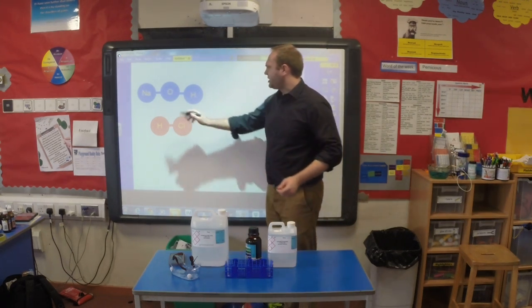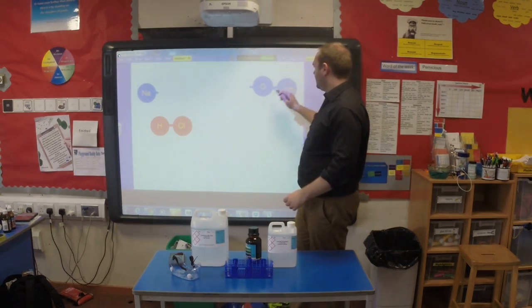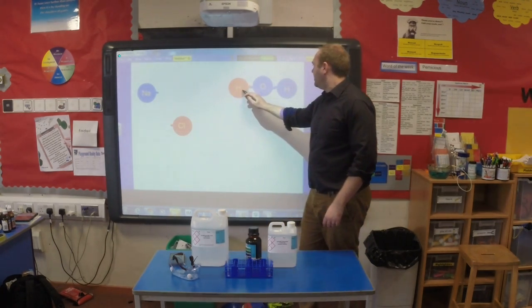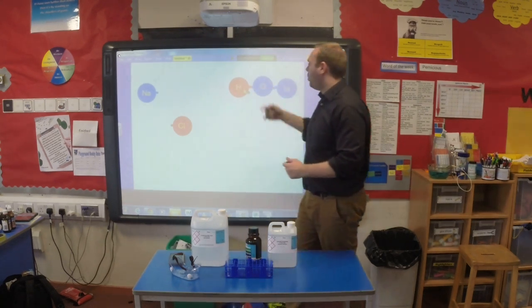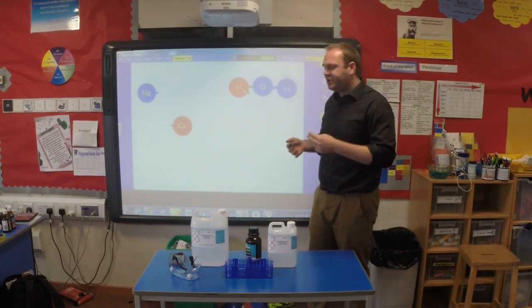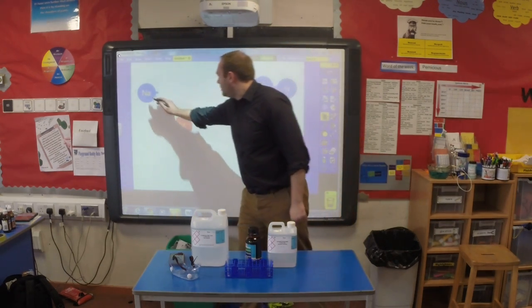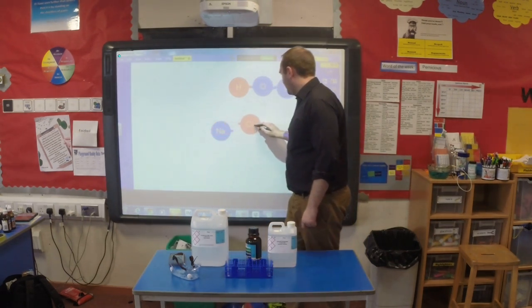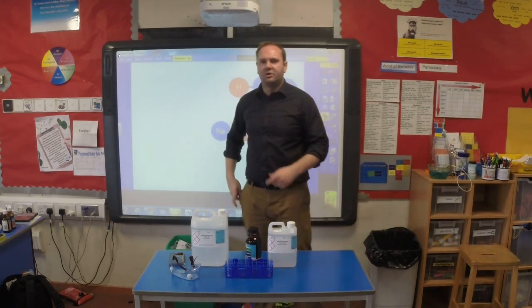So what's water made of? Well, it's made of an oxygen and 2 hydrogens. Okay? So every time that this solution goes green, you know that you've got water back in it. Well, what other 2 chemicals does that leave? It leaves us with a sodium and a chlorine.